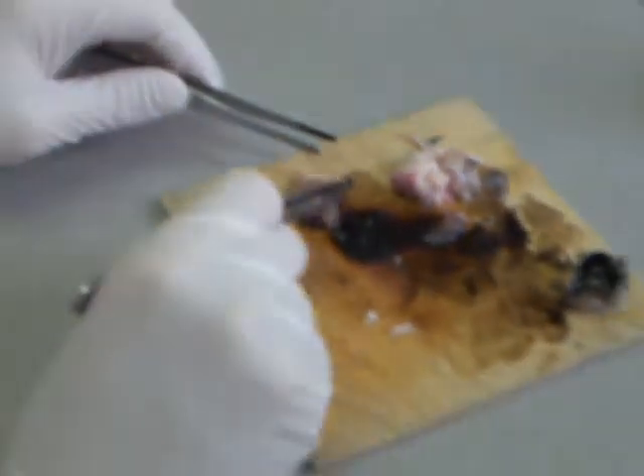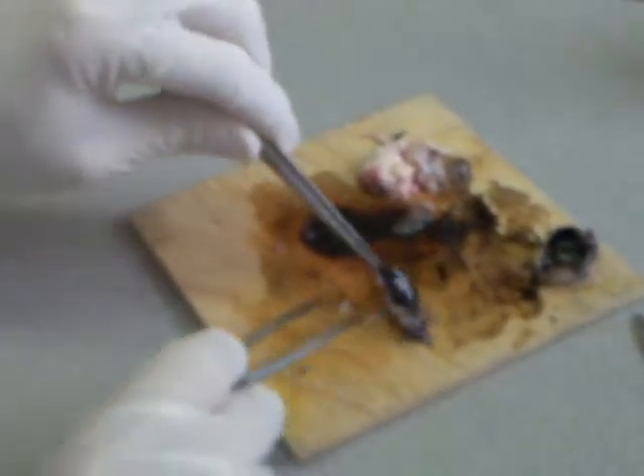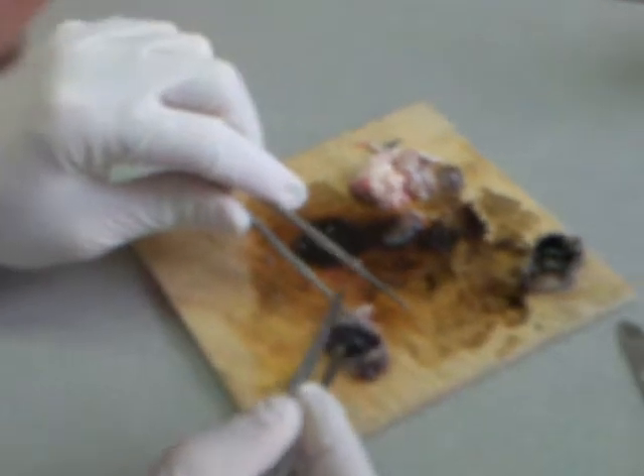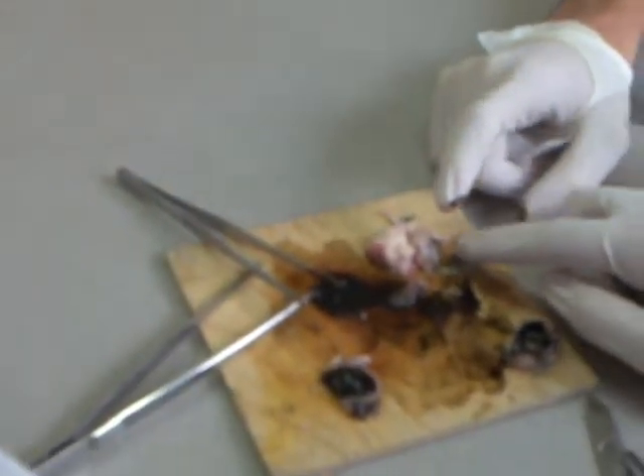When this animal died, what was it focused on — something far or something close? Something very close — because the lens is fat. With a camera, if you want to focus far or near, you move the position of the lens away from the film. But with an eyeball, your lens doesn't move in and out — it gets fatter or thinner. This is like a magnifying glass.